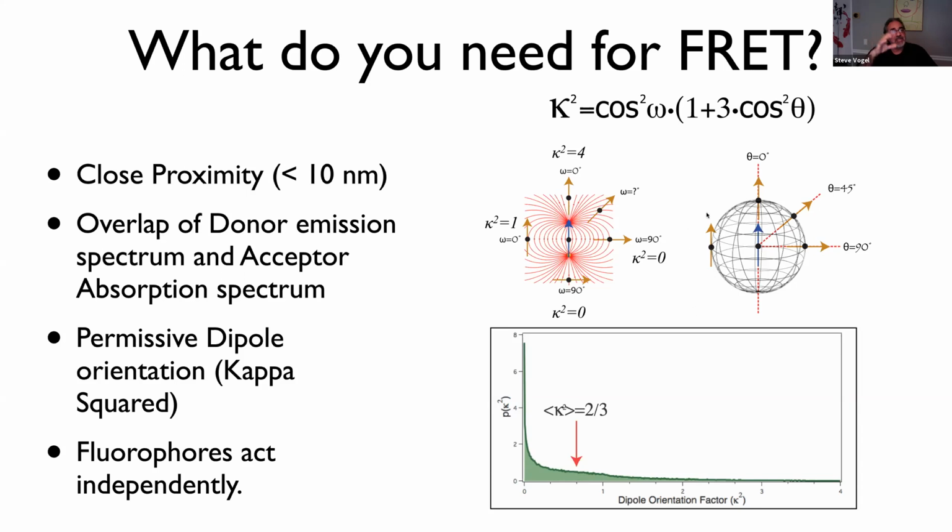And they can be changed in two ways. In this case, which are changes of where in space relative to the donor can you place the acceptor. You could place it here on the equator, you could place it here at the pole, you could place it here somewhere in between. Right? This would be the same value regardless where it is along that meridian, right? The other thing is this donor sets up an electric field, and that electric field has to be sensed by the acceptor.